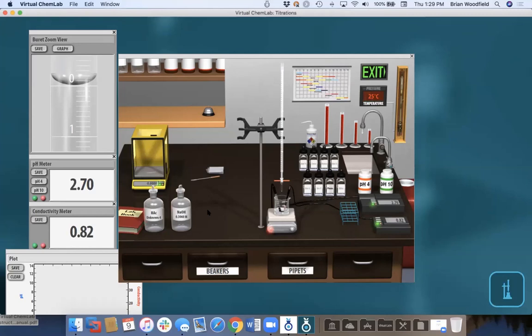Absolutely, yeah. But a user like us, we don't have access to those equations to explain some of these to the students. Like say, okay, Henderson-Hasselbalch is too approximate, and these guys have taken it way beyond Henderson-Hasselbalch, and here's the reason why. We cannot do that. Yeah, you can't. Well, it's the same thing. If this was in a real lab, you would do the same thing, right? They would measure it for real, and then you would say, well, this is where Henderson-Hasselbalch fails. This is why it's only good to 3 to 5%, but this one's much more accurate, right?